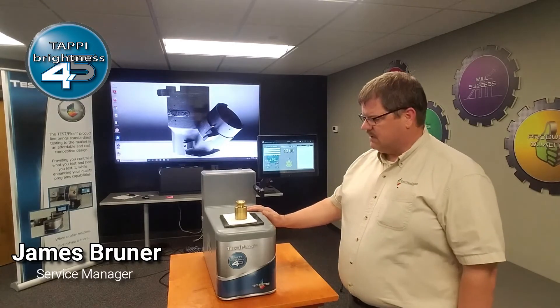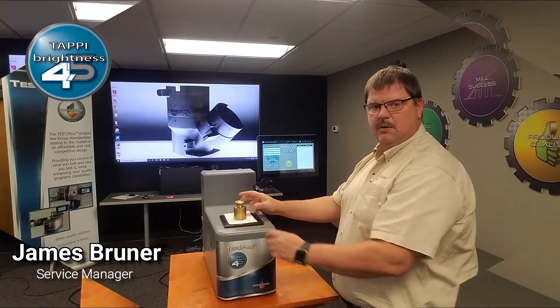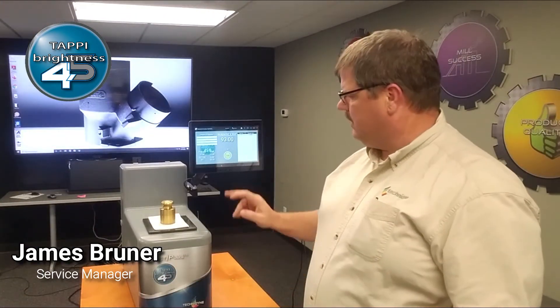This instrument is very simple to use. You will load your sample, place your one kilogram weight on the instrument, and press test. The screen updates immediately.